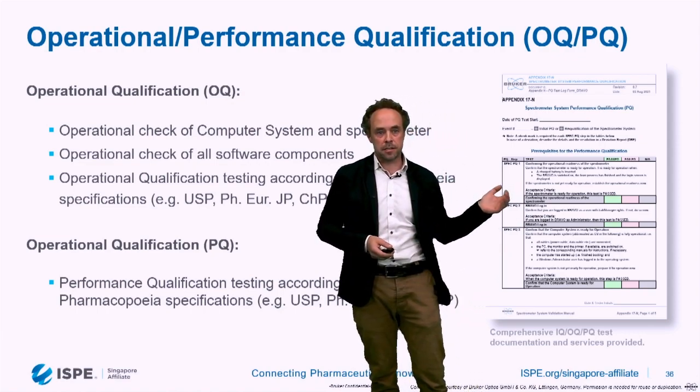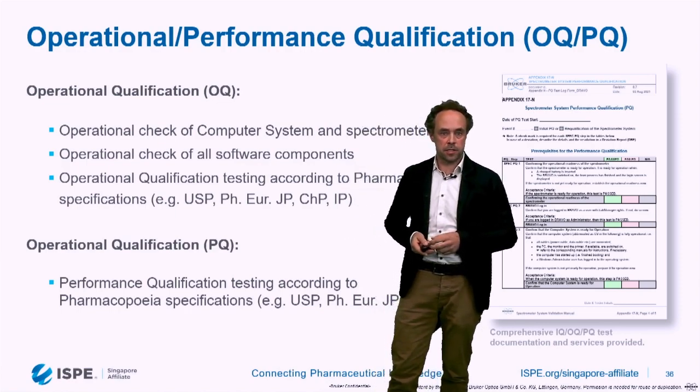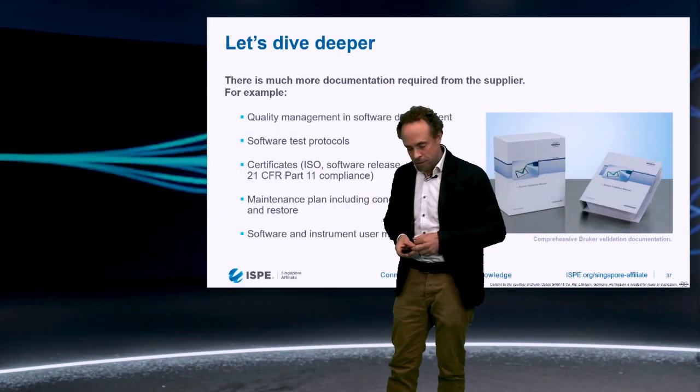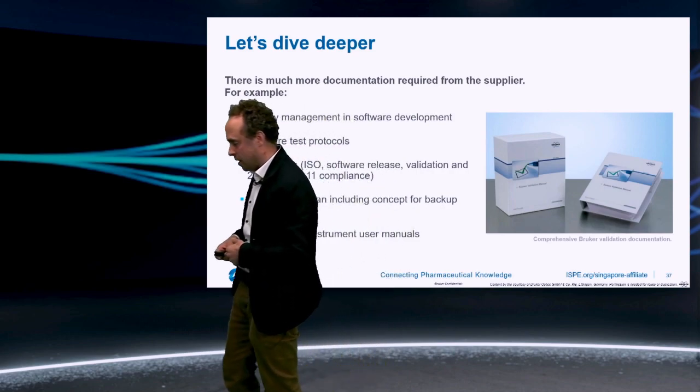We have comprehensive test log forms where all these IQ/OQ procedures are well documented. But that's, of course, not all the documentation which a vendor needs to provide.